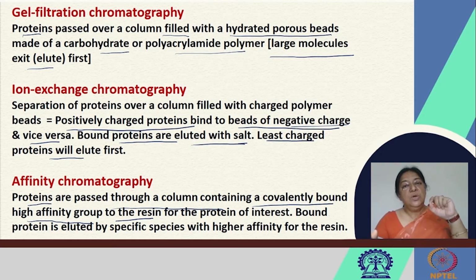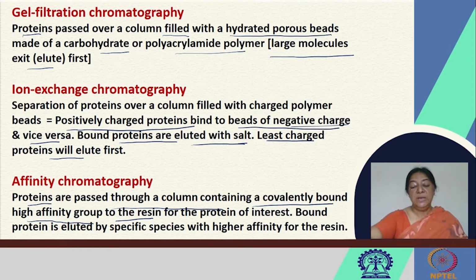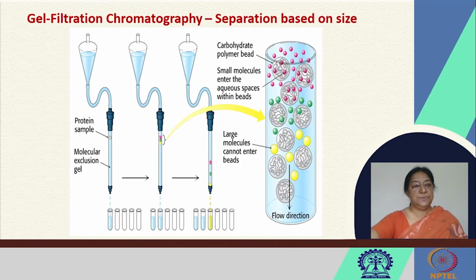So a protein or the DNA or the glucose is bound to the resin or the bead, and our protein of interest will then bind to the specific component that is added to the bead and then can be eluted. We will be briefly visiting each of these types of chromatography to give us an idea of how the procedure is accomplished.